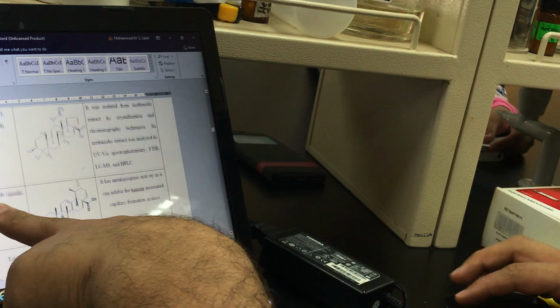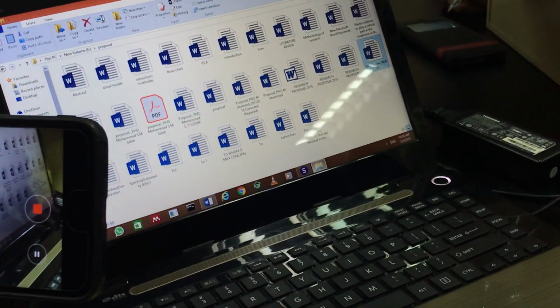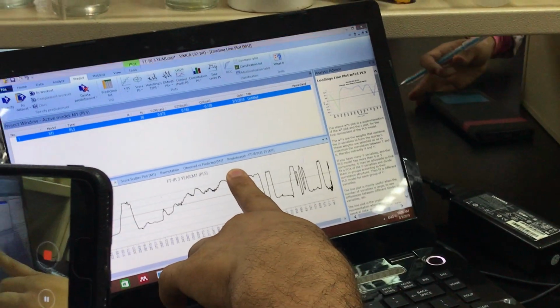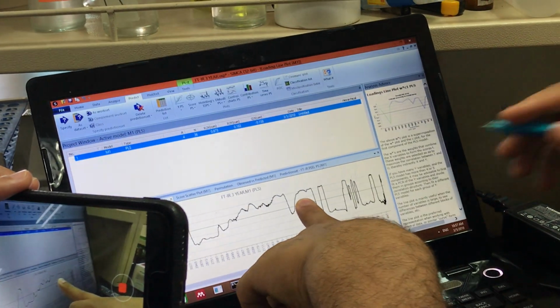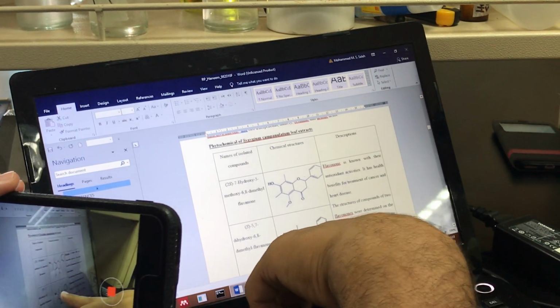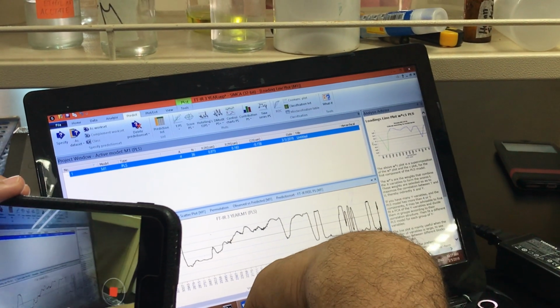So we will compare the loading line. You can see here, OH. CO, here there is CO. This one, in the upper one, is the active site. You can see O, this one is also available. C double bond O, here you have this C double bond O.